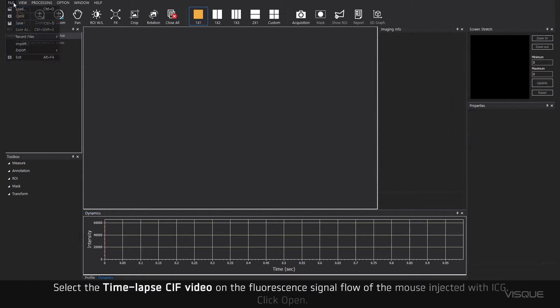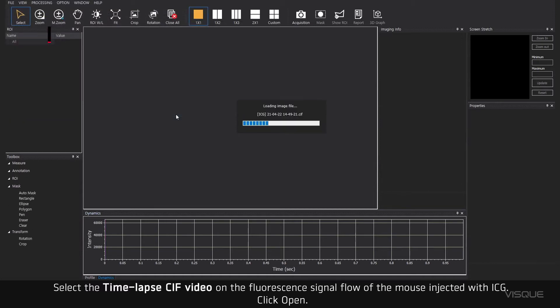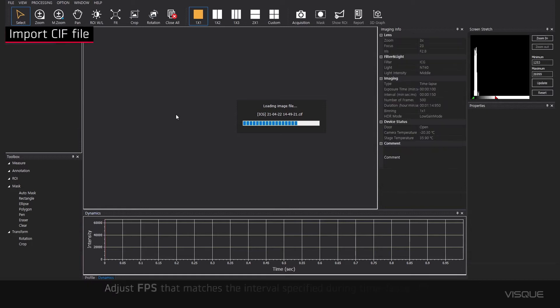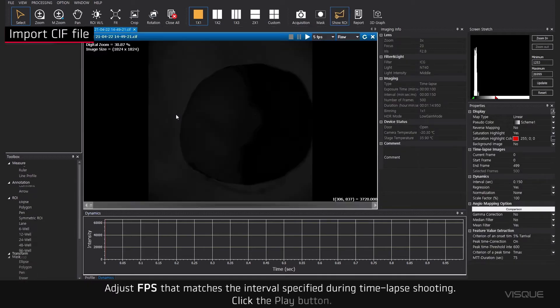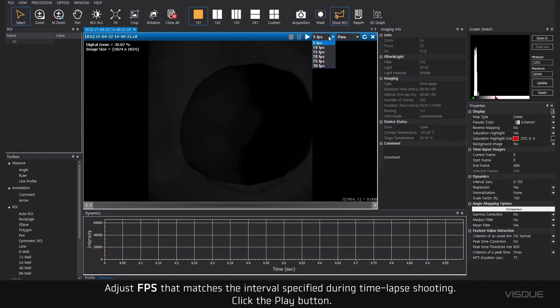Select the timelapse CIF video on the fluorescence signal flow of the mouse injected with ICG. Click Open. Adjust FPS that matches the intervals specified during the timelapse shooting.